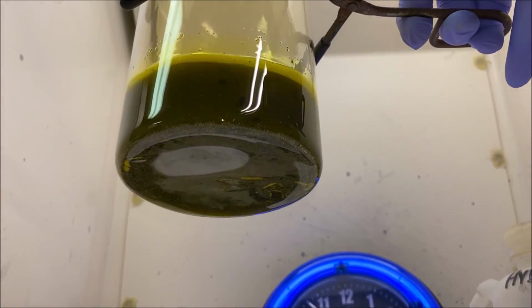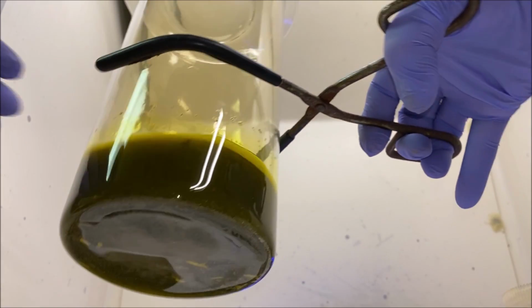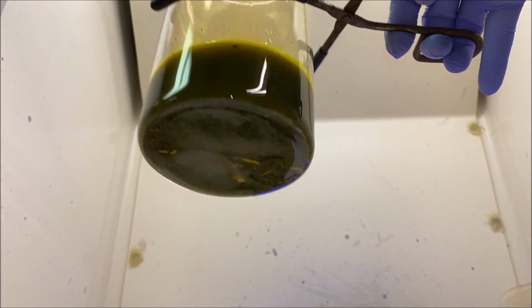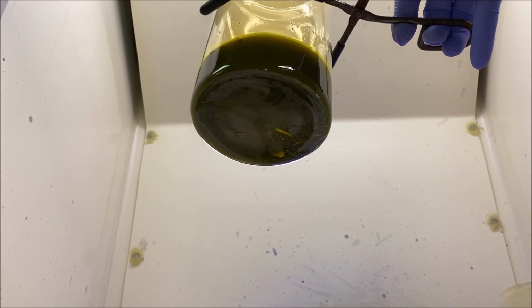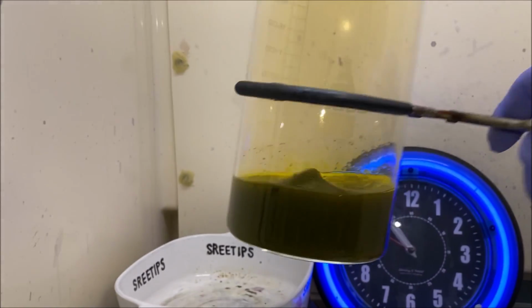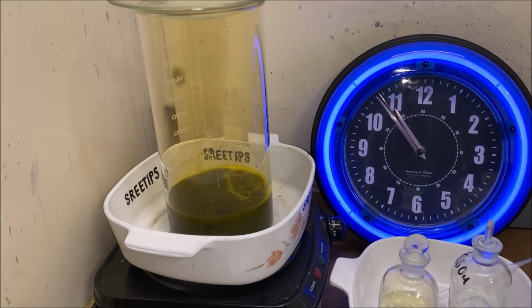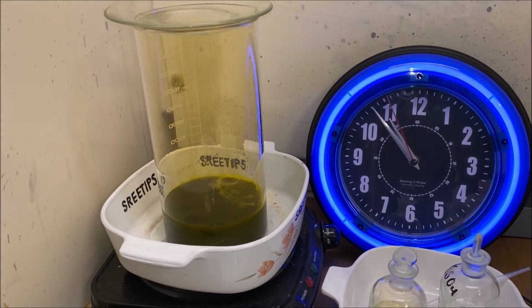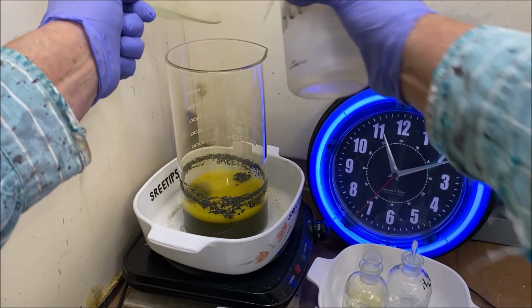Let's see what we got under here. I don't see a whole bunch of material. It's kind of hard for me to get a video of it and look at the same time. I do see some strips that look like it might be metal. So we're going to set this back on the heat and go ahead and continue to let this boil for a few minutes. This has been on boiling in aqua regia now for about an hour, I guess.